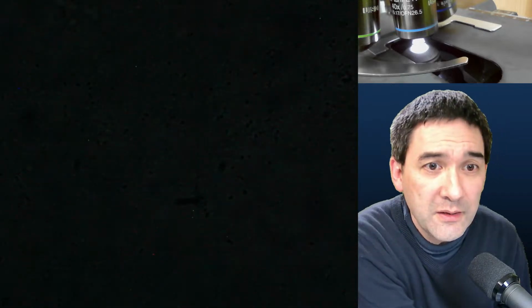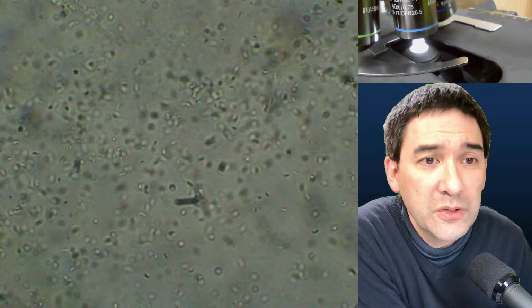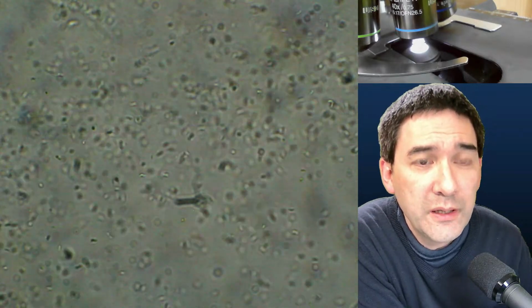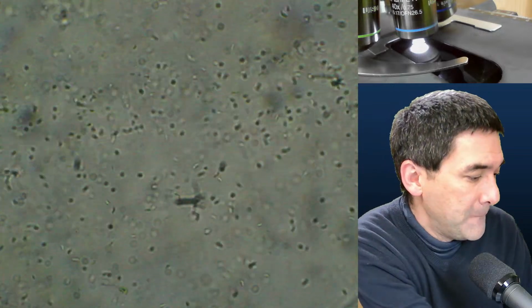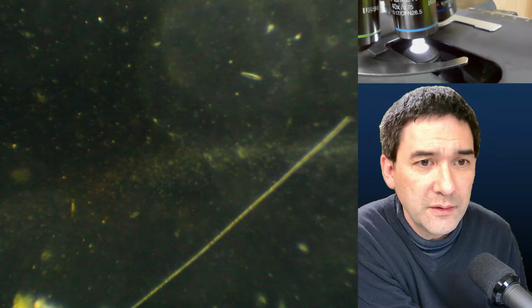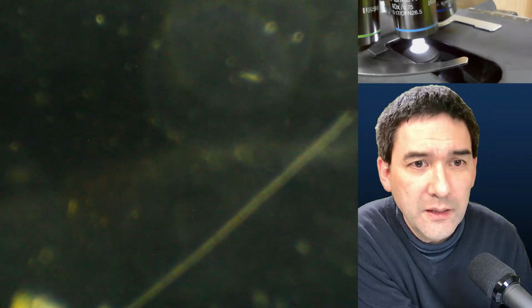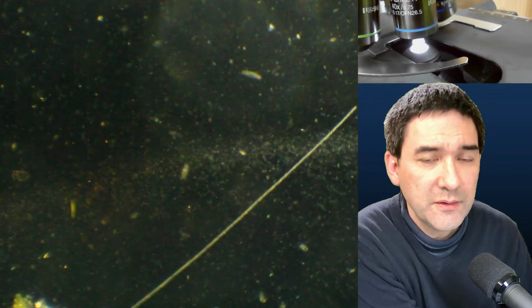With 40 times, that's how it looks. Using 40 times, it's also pretty well visible. But with 10 times again, with the dark field in place, and opening the condenser again, then you're able to see them at better contrast.